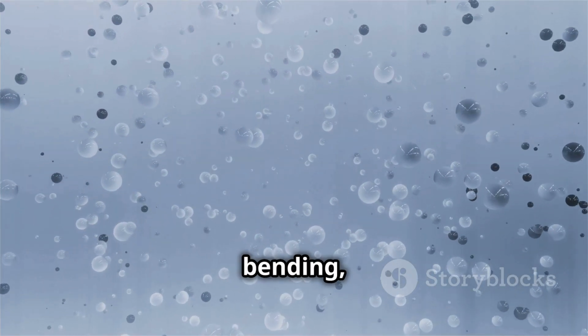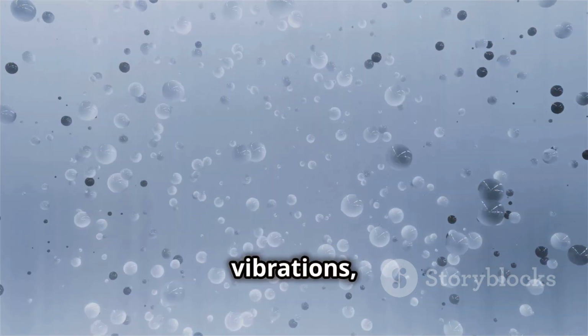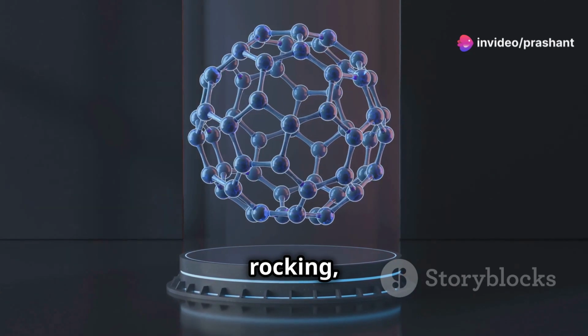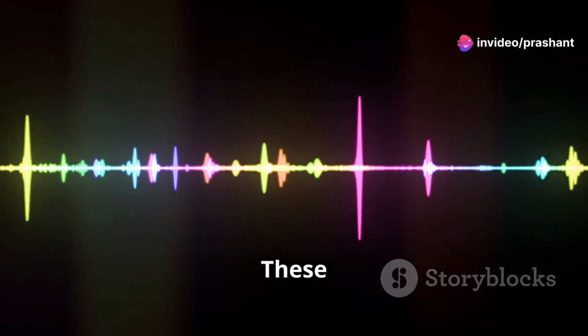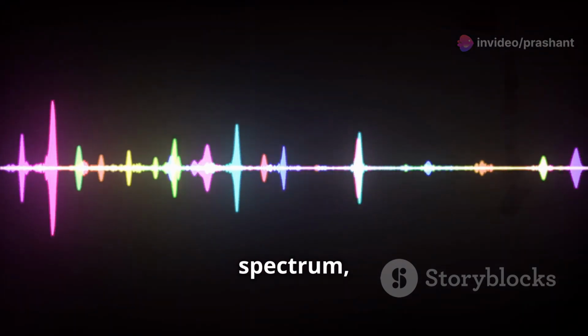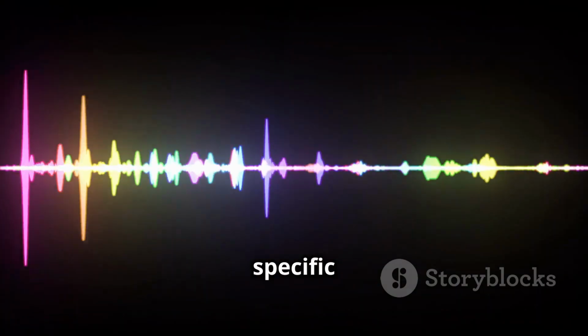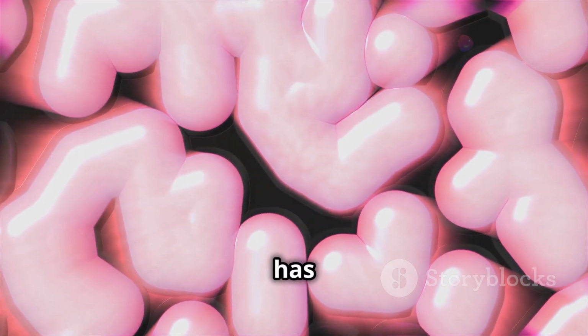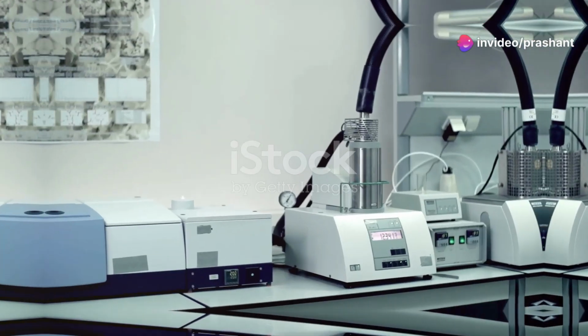Within stretching and bending, there are even more specific vibrations like symmetric and asymmetric stretching and scissoring, rocking and wagging for bending. These different vibrations create a unique pattern of peaks in the IR spectrum, allowing us to identify specific functional groups within a molecule. It's like each vibration has its own signature move.